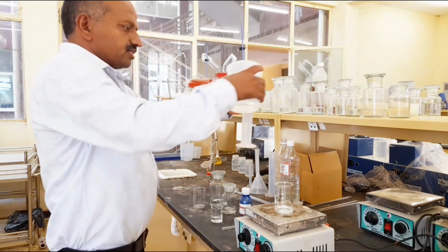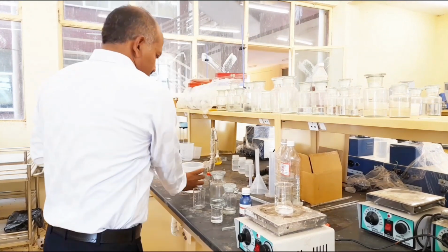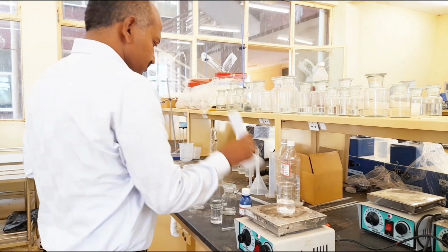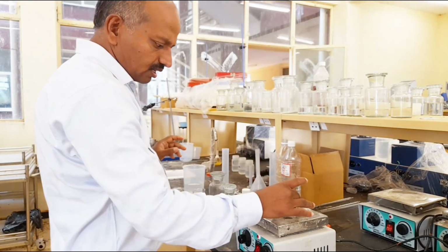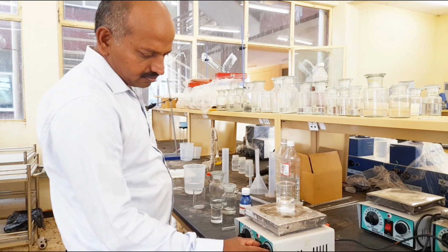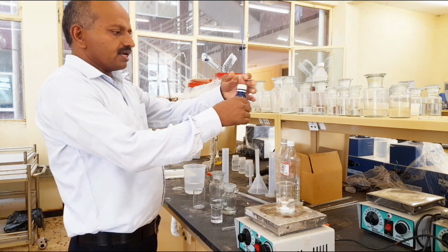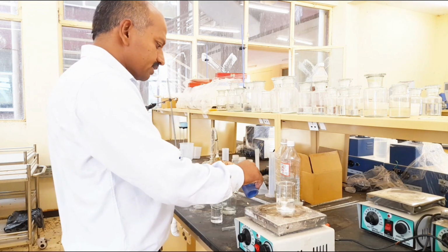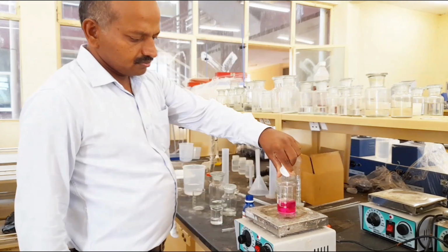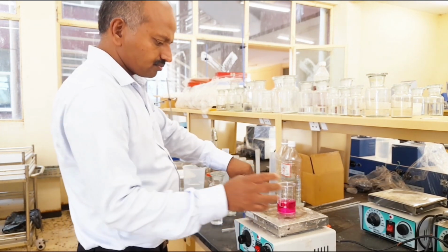Now I am adding 30 ml of distilled water as per the procedure. Now the solution is colorless. Now I am placing it on the magnetic stirrer. Now this is the phenolphthalein indicator; 1 or 2 drops are to be added. You can see a dark pink color is formed.